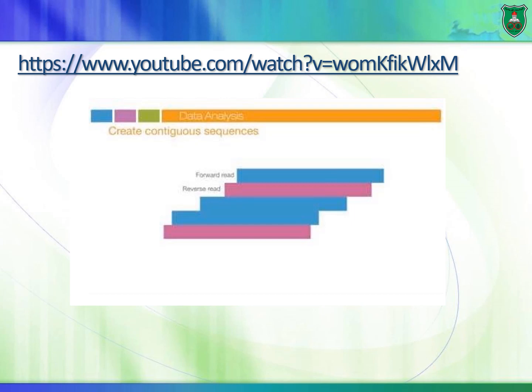Now, these are all details. Now what they're doing is they're trying to read, or synthesize, or sequence the other strands. So we can have sequencing of both strands done at the same time. Okay.